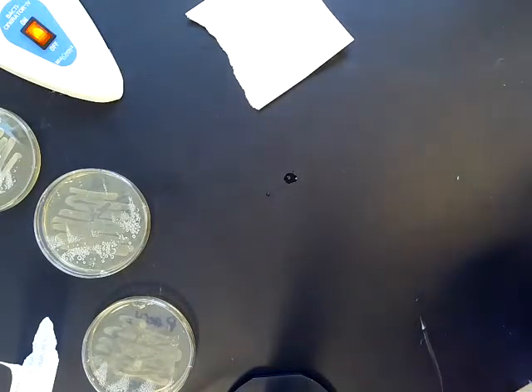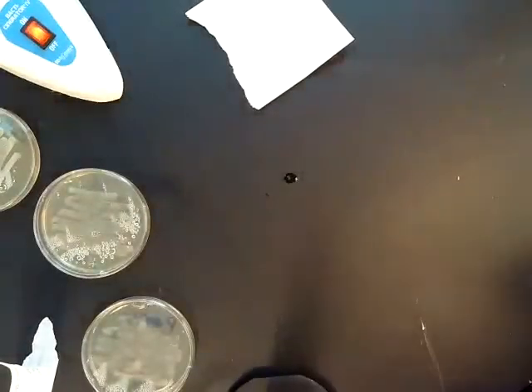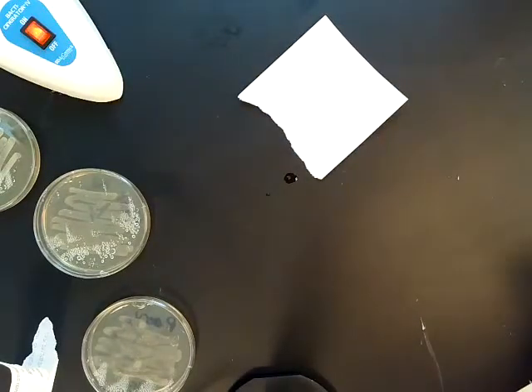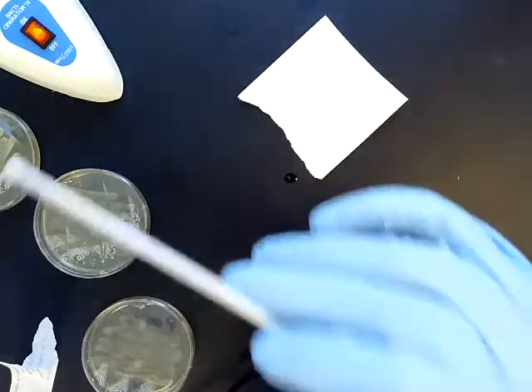So first we're going to start with the indole test. And there's a couple different ways to do the indole test. You can do the rapid spot test, which is what we're going to do today, or you can incubate it in tryptone broth and add the indole reagent directly to that broth. But we're going to do the quick method so you can see results today.